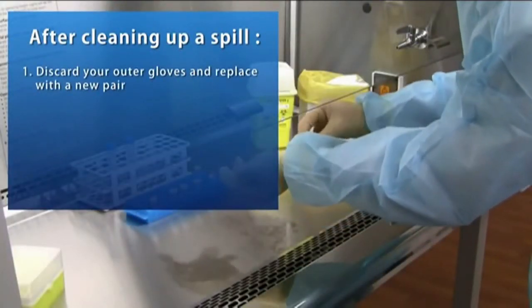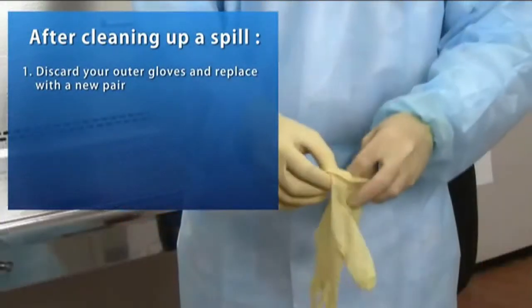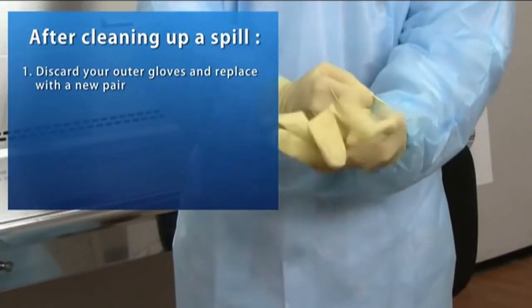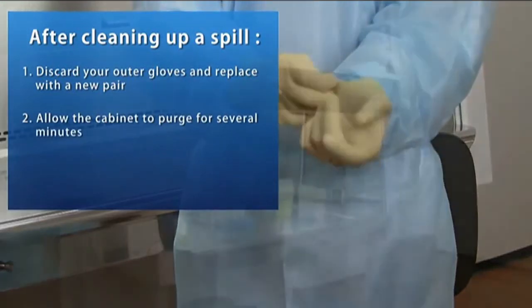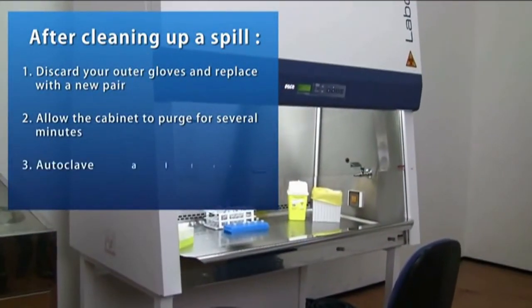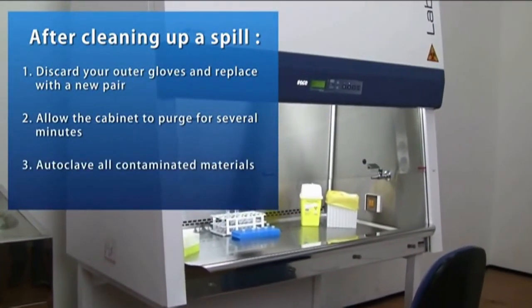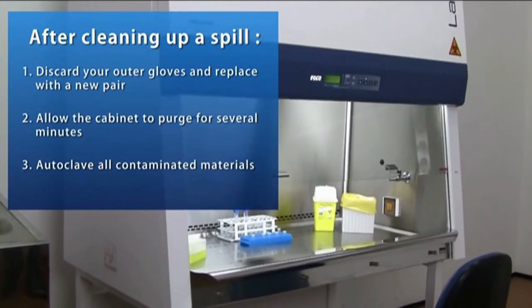After cleaning up a spill, discard your outer gloves and replace them with a new pair. Allow the cabinet blower to run purging the work zone for several minutes. And be sure to autoclave all contaminated materials. Take care.